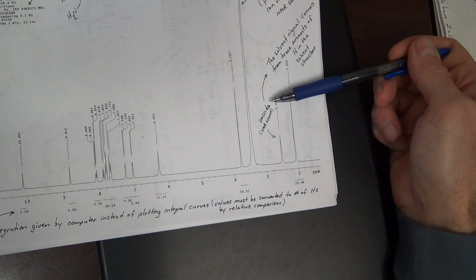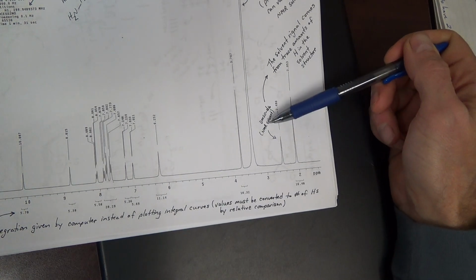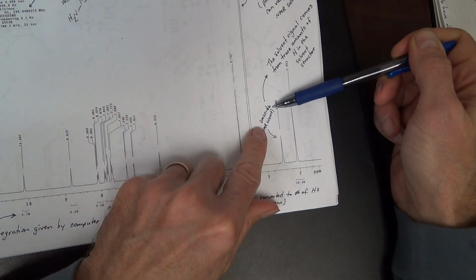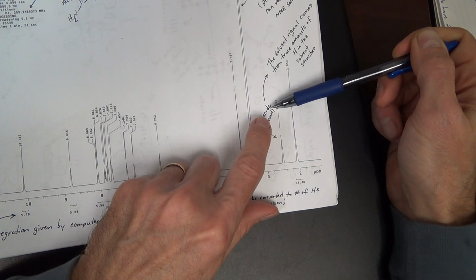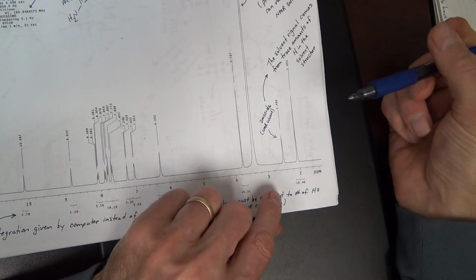Okay, a real NMR is going to show a peak for your solvent. This is DMSO D6, if you remember solvents. Now, DMSO D6 does not have any hydrogens, and that molecule does not give a signal in the HNMR.